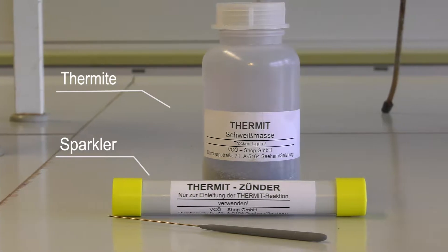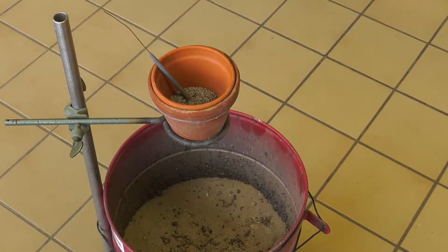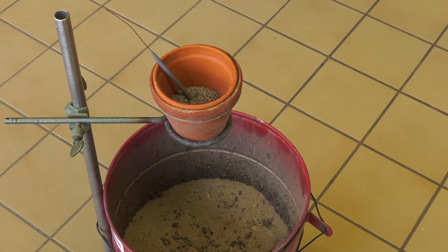For the thermite reaction experiment you'll need an aluminium iron oxide mixture called thermite, a sparkler, two pots and a tripod.